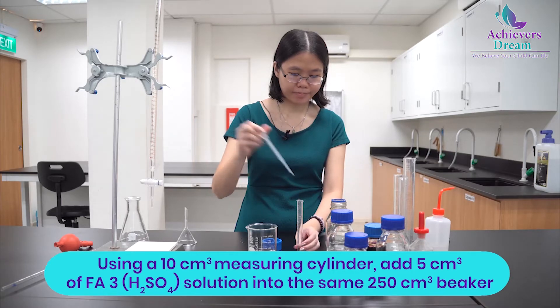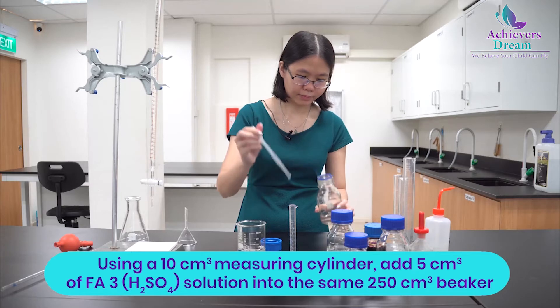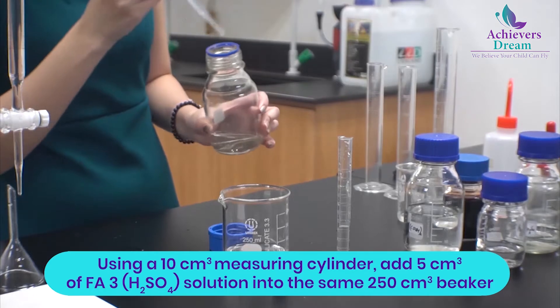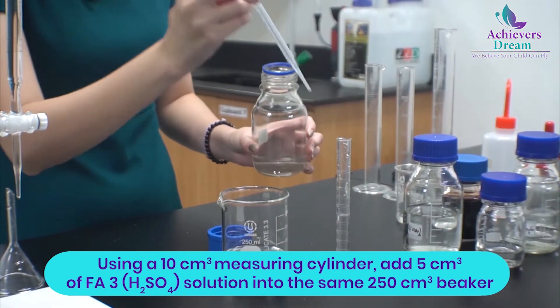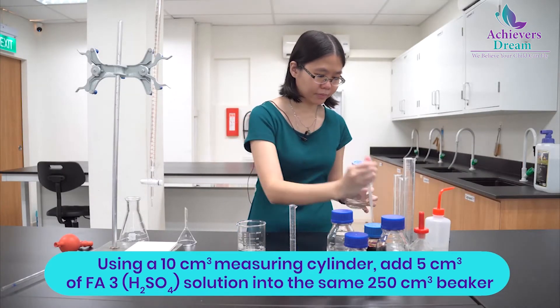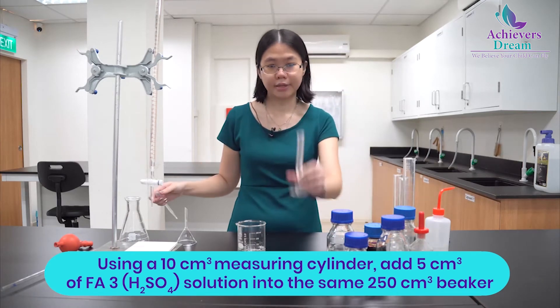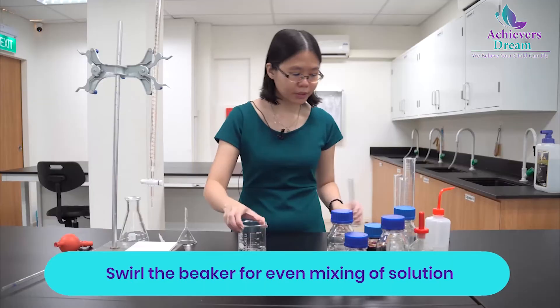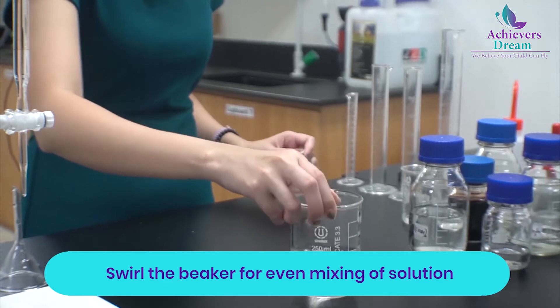Add 25 cm³ of deionized water and pour it into the beaker as well. Then add 1 cm³ of FA4 and 2 cm³ of FA5 into the mixture. Give the beaker a gentle swirl so that all the solutions mix well.